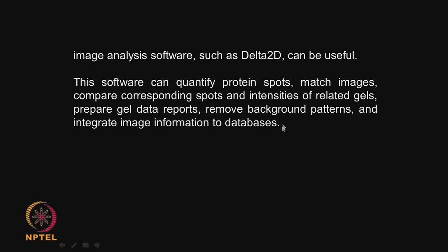Nowadays there are something called spot pickers, which using an electronic system can pick out a specific spot, and without a human touch directly inject it into a MALDI using a solvent, and then identify the molecular weight and the sequence of those proteins. So, such advanced studies could be done with the 2D gel, which I showed you.